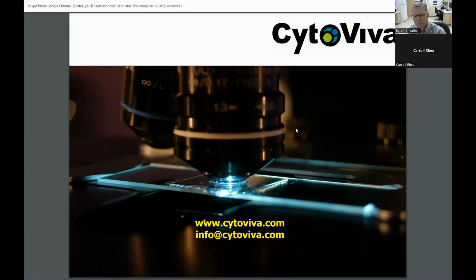I don't know if you remember the very first methods paper that we demonstrated, by Dr. Enrique Toma and his group at University of Sao Paulo. This was a number of years ago, where they looked at different size and different shape plasmonic nanoparticles that produced different optical spectra that they were able to quantitatively measure. And the other paper that we showed from Dr. T. Pradeep, looking at the ultra small gold nanorod, looked at plasmonic nanoparticles of different shapes and sizes, and even employed cross polarization to look at orientation of these nanoparticles, in addition to their optical spectrum, to understand how different sizes and shapes and deviations change the optical spectrum.